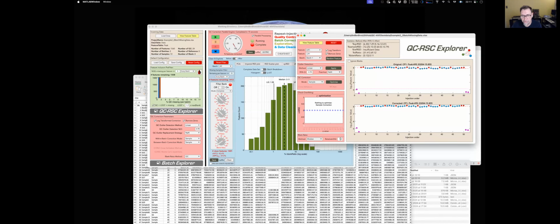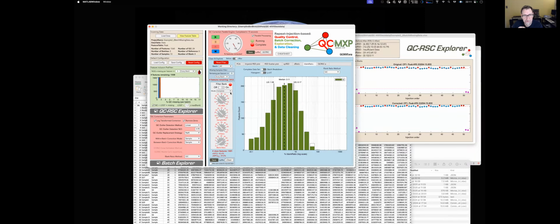You can do it, if we're going into the weeds. When you're on here, you can do these calculations based on everything, or you can... I'll talk to you offline about the levels of complexity. If you're starting to do 10 or 15 batches, then you have to accept that maybe one of your batches is just going to be dreadful, and you might have to remove a whole batch. In which case, you don't want to use any data in that batch for any of your filtering. So you need to look at different ways of summarizing your statistics so that you only look at the statistics from the batch which has the best RSD or the best D ratio, etc., and then that's what's used to filter. So there's various permutations, and it does get complicated.